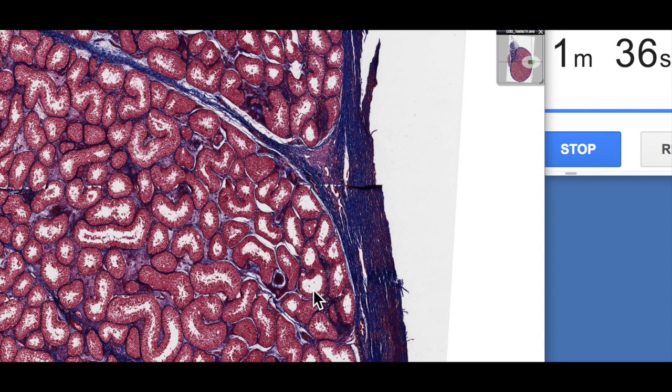These lumen here, these are actually seminiferous tubules. These are blind-ended tubules within which spermatogenesis takes place. So that's where the sperm are actually made.